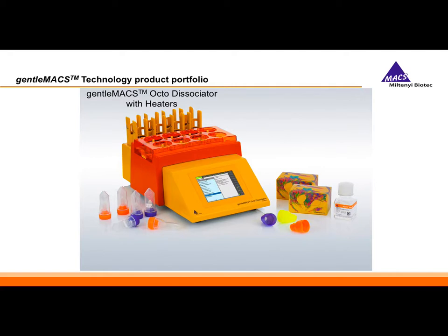And then the C tubes are for cellular work, so that's for saving those cells, making sure those cells aren't breaking apart. Our M tubes are for molecular. It's basically just breaking apart everything, so you can do your mitochondrial work, your protein work, your DNA and RNA work.